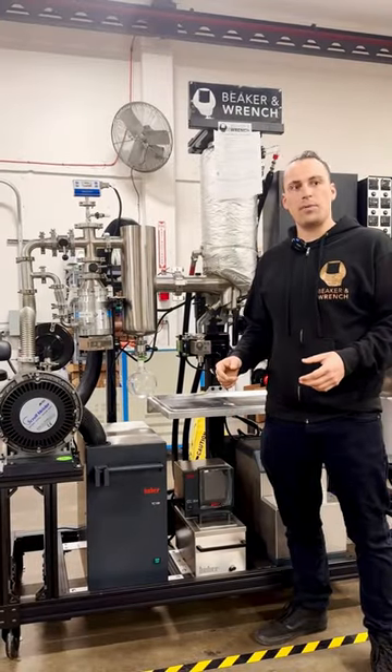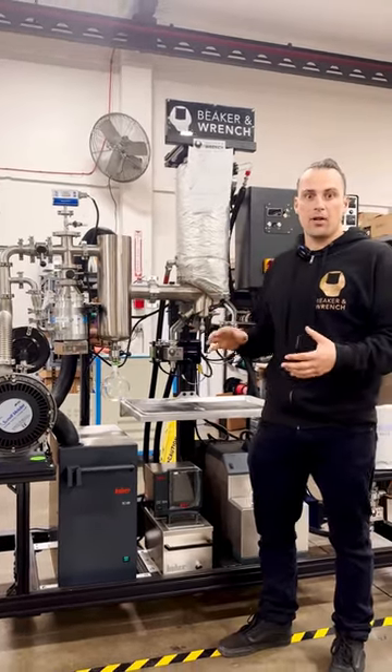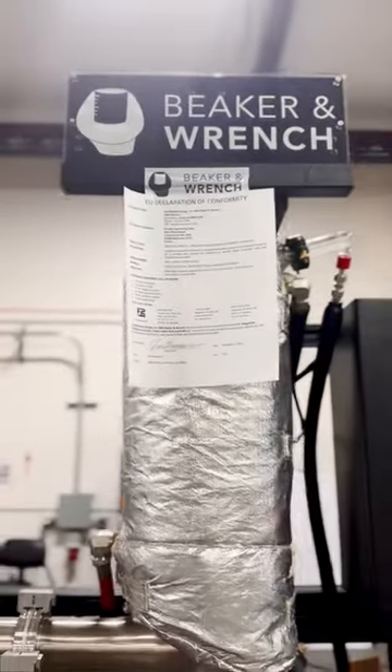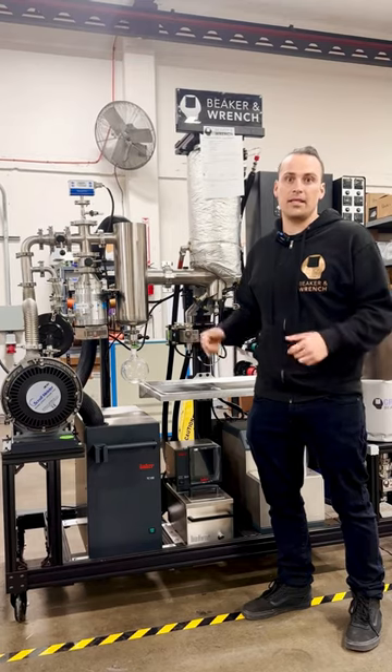The CE mark is important because it certifies that this unit complies with the health, safety, and environmental standards of the EU, and can be imported into the EU and any other country that requires the CE mark.